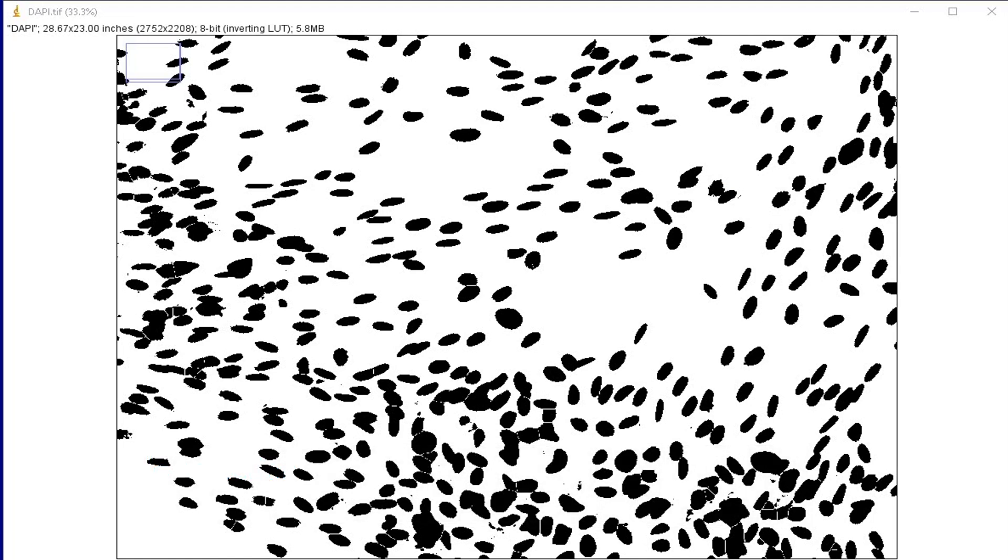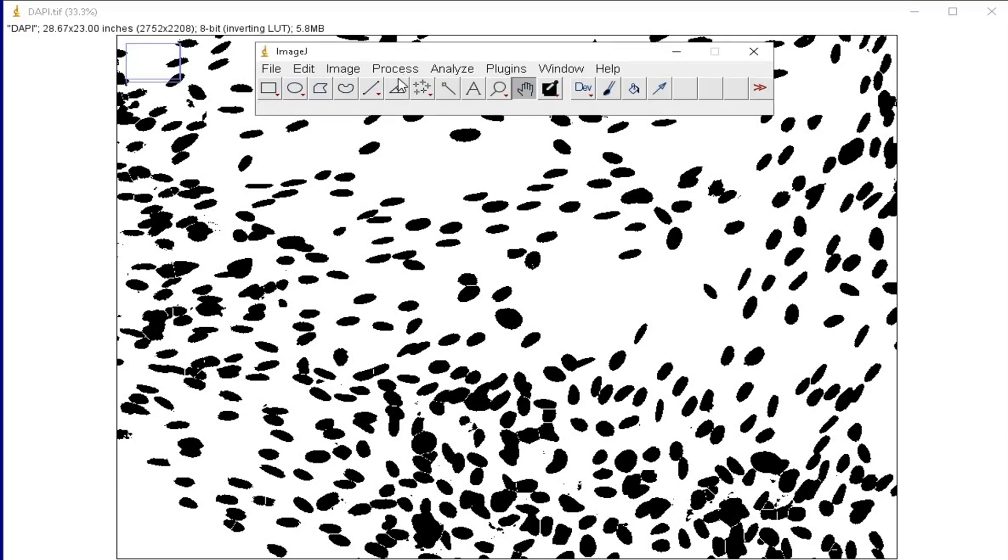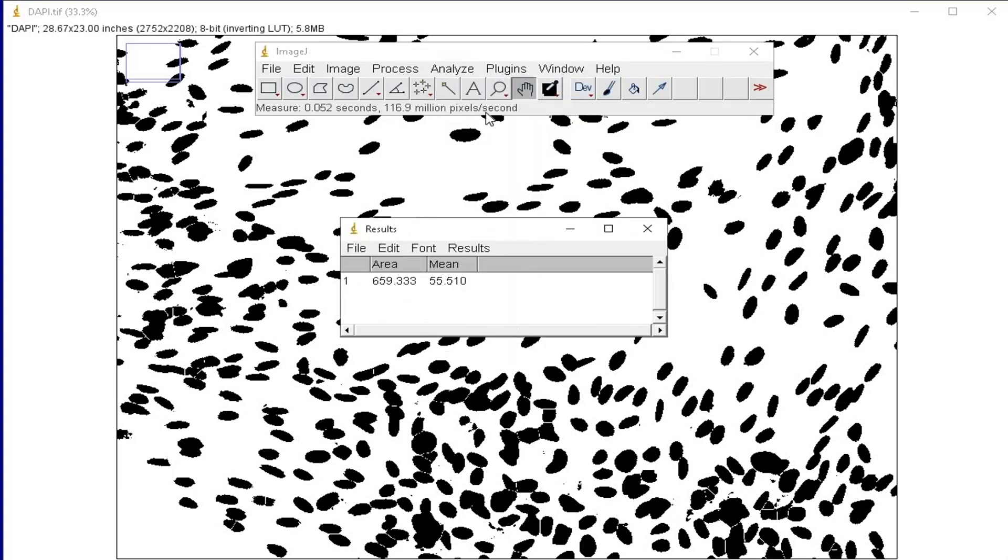Retrieve the watershed image from earlier, and then click Analyze, and Measure.